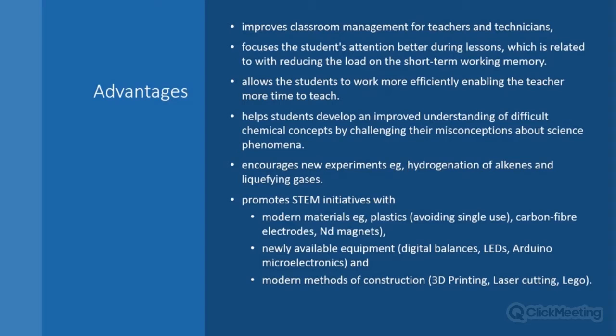Now that may conflict with some rather regimented rules that you might have in laboratories, where you've just got to convince people to do it, because you've got to have the control, and it does focus the attention of the students better.